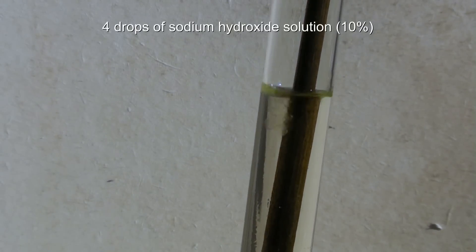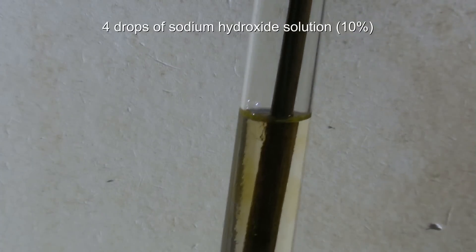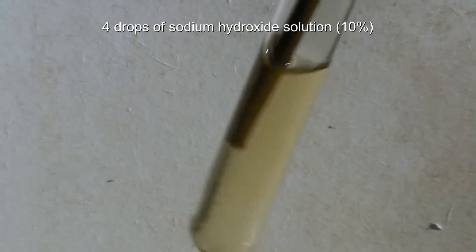When the mixture has reached 50 degrees C or less, a long thin wooden stick is placed in the test tube. Now 4 drops of a 10% sodium hydroxide solution are added and the solution is well mixed with the stick. At this point the reaction can already begin.